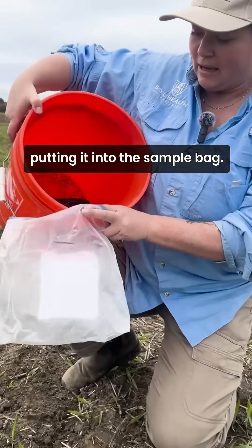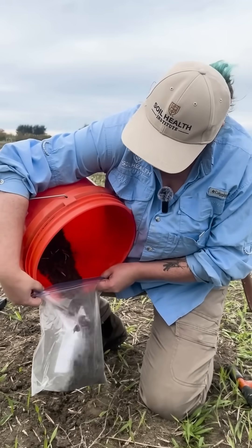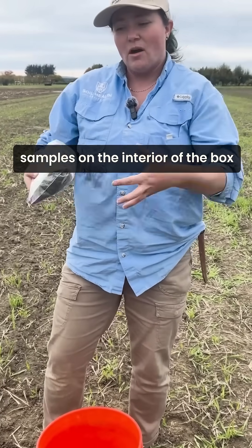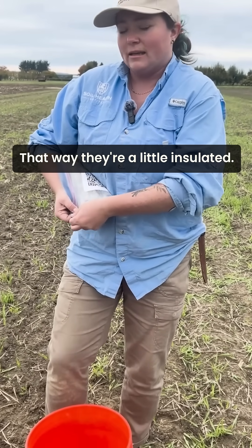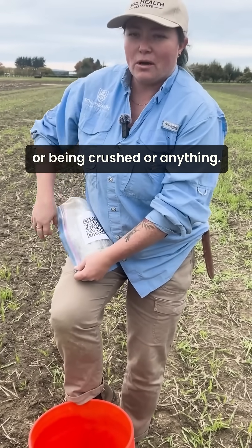When putting it into the sample bag and packing these bags, what we might want to do is actually put the aggregate stability samples on the interior of the box and the soil core samples on the exterior — that way they're a little insulated. You want to make sure they're not rolling around when you ship them or being crushed.